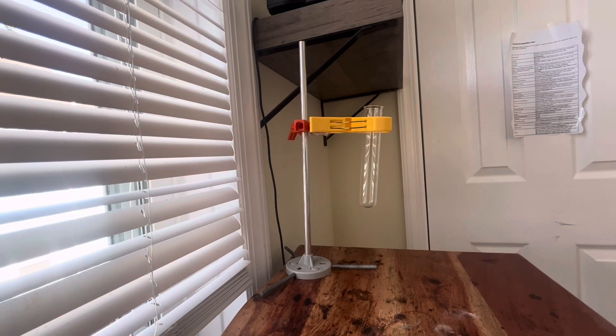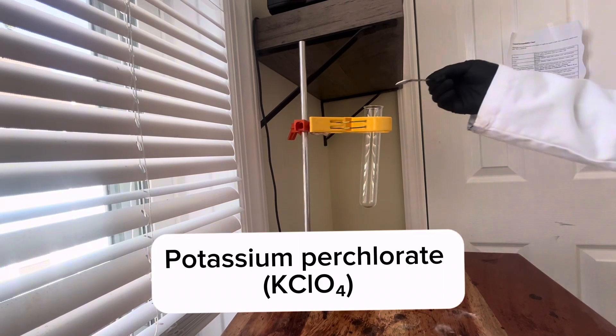Hi guys, today I'm going to show you how to make oxygen gas. First we're going to need something called potassium perchlorate.